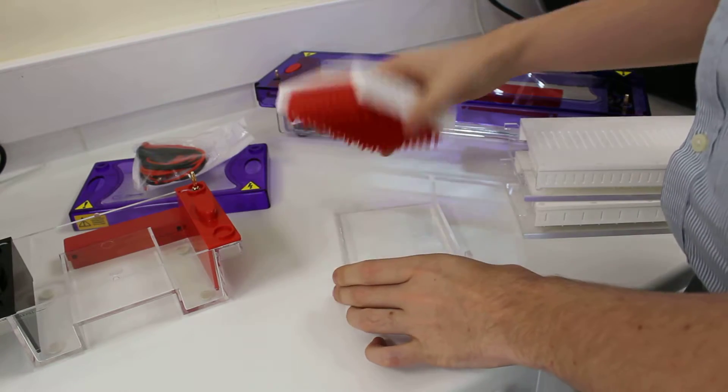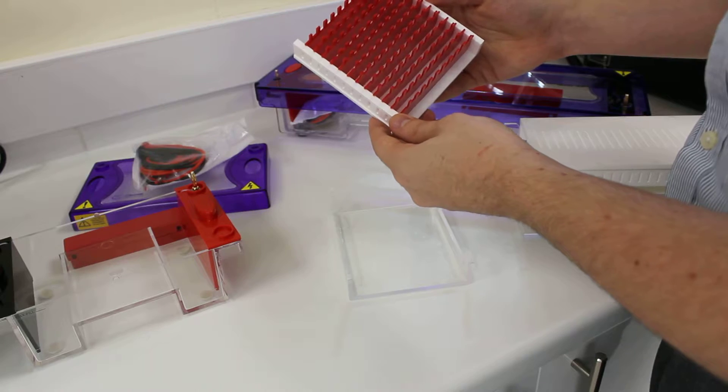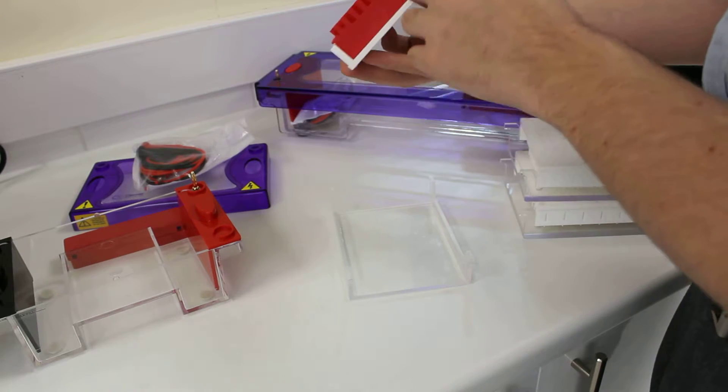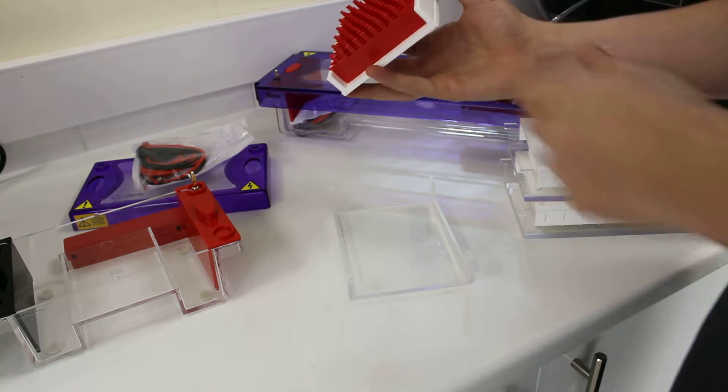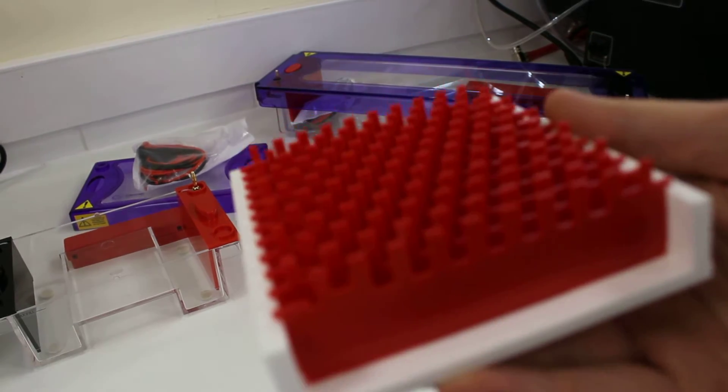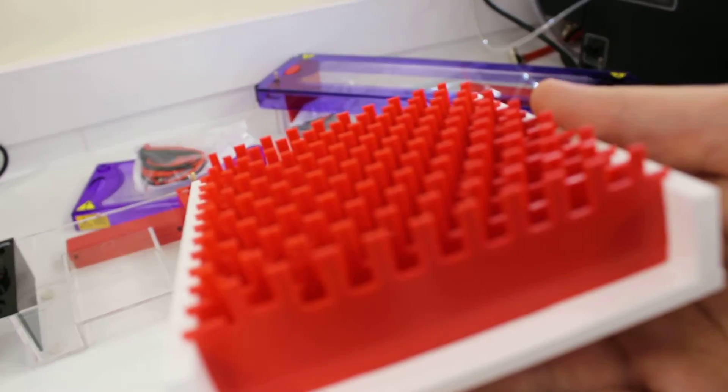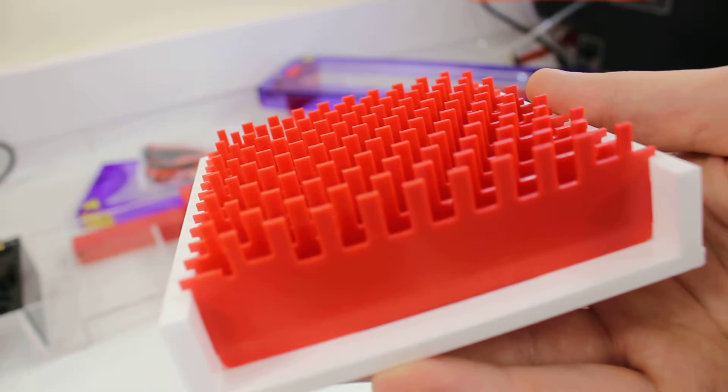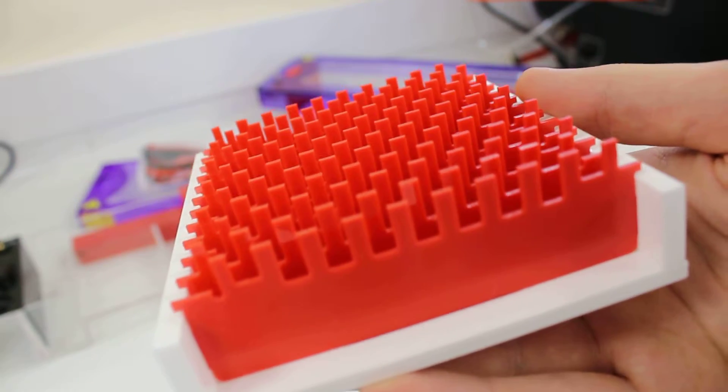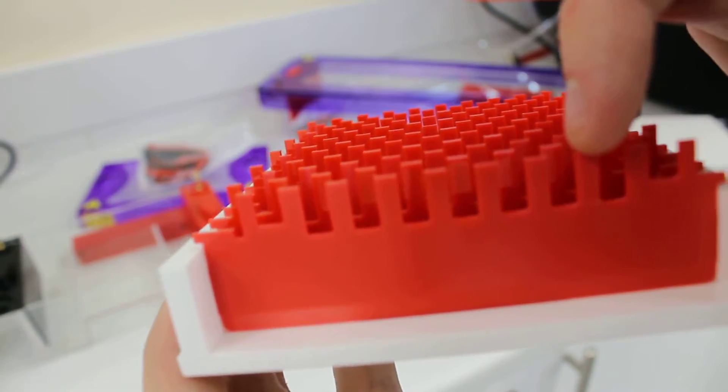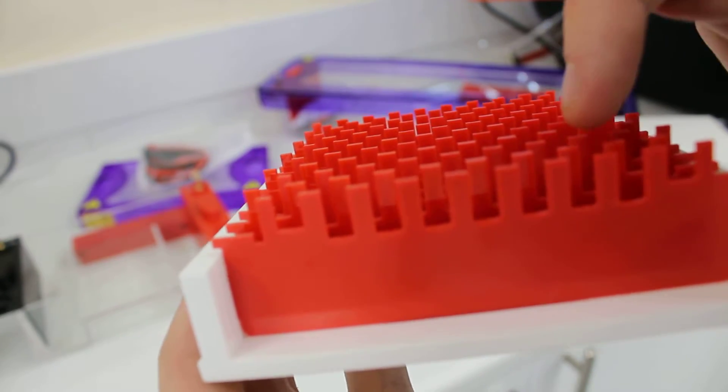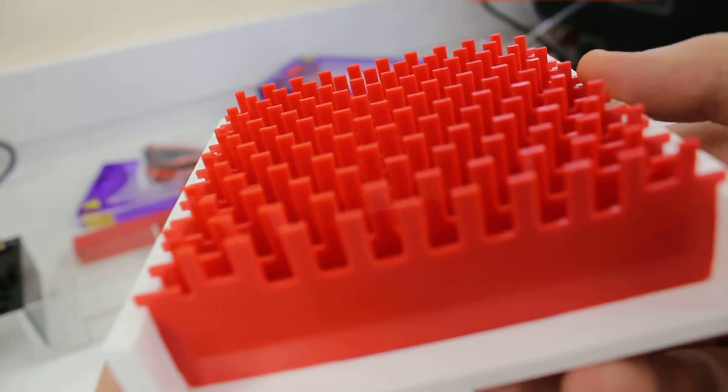The comb block has 96 spaces and you can get it with either one or two marker lanes at the side. I'll just do a quick zoom in so you can see how they are arranged. You can see they are arranged so they are actually running through the row in front, so you get a slightly longer run length than you would otherwise.